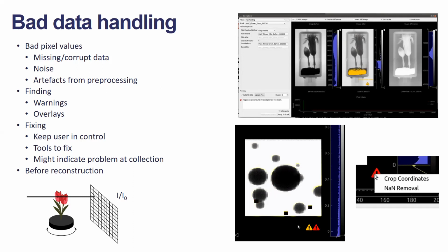If you put that into a reconstruction algorithm, you get generally pretty weird results because it's non-physical. So it was important to make it clear to the user why that was happening and what they could do to fix it. We did initially think maybe this is something we can just solve automatically. If it's negative, we increase it to 0, just clamp it. But through discussion with the users, they wanted really to know what was wrong and understand how they could fix it.